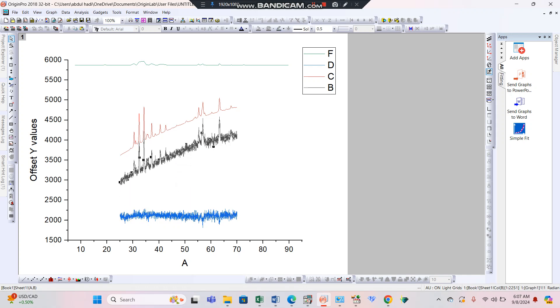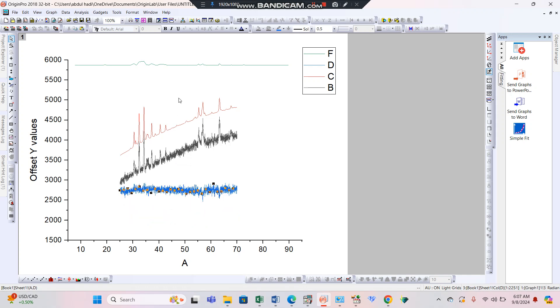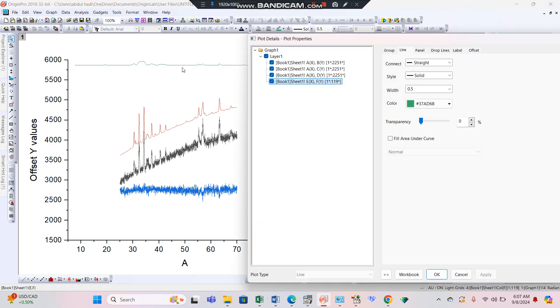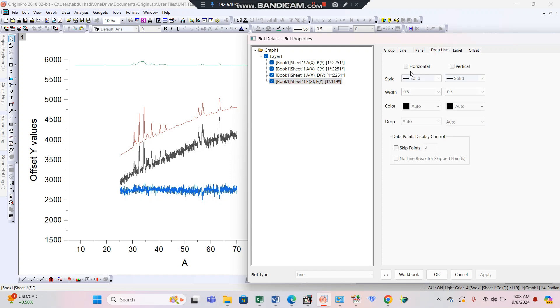Now click on the JCPD card. In the line panel, select drop line. We need a vertical drop line — select the vertical drop line option.